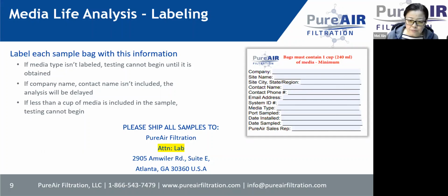Another thing is, a lot of sample bags, when they arrive to the lab, it's broken and samples mixed together. So we cannot test because it's not properly sealed. So please use a good quality, very thick airtight bag, not a very thin sandwich bag you use to pack your sandwich. We have seen a lot of occasions of samples broken.